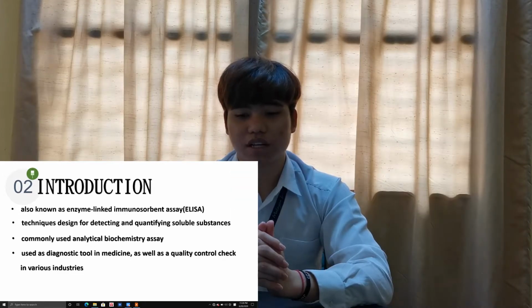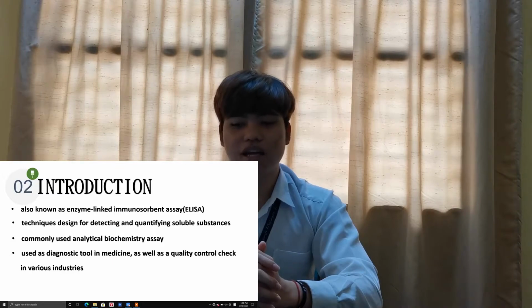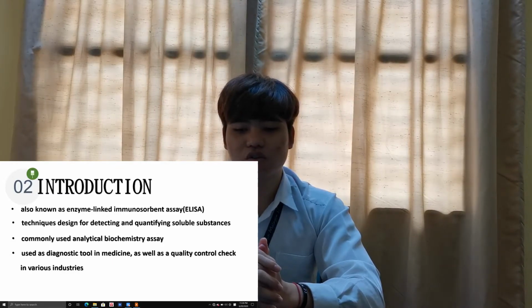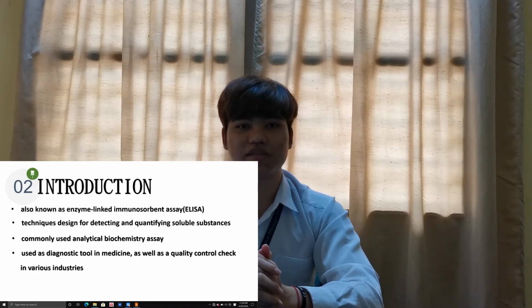For the introduction, ELISA assay is also known as enzyme-linked immunosorbent assay. ELISA assays are commonly used analytical biochemistry assays. The function is very wide, used as a diagnostic tool in medicine as well as quality control checks in various industries.